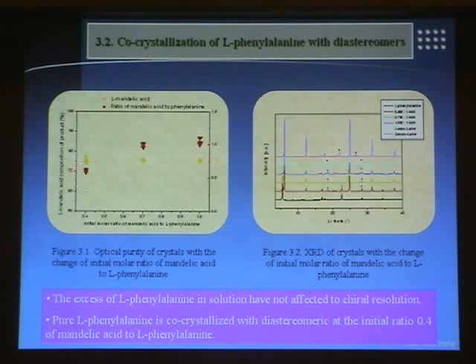However, for this sample, the ratio is different, because, yes, you can see here the L-phenylalanine is 2 times as much as mandelic acid.